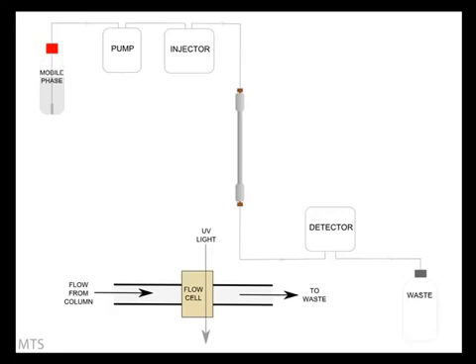Not all components absorb UV light, and those that do have different responses, so these factors need to be considered when choosing a suitable detector. There are a range of different detectors available which may be used for HPLC. These include MS, which passes the flow coming out of the column into a mass spectrometer, thus obtaining information on the amount and molecular weight of the compound.